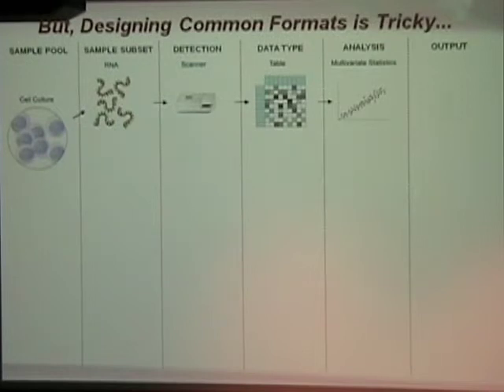So I said you're getting formats from various vendors. The typical move when you're doing something like that is to say, okay, first I will extract out into some common, agreed upon, non-platform specific standard. And there's a caveat here that this can be quite tricky to do, and I just want to show you how I think as a field we've taken a slightly wrong turn in that department.